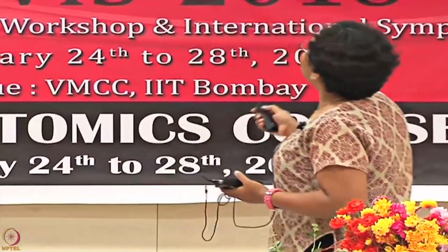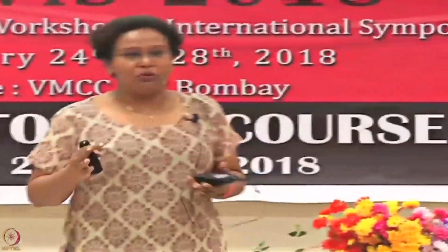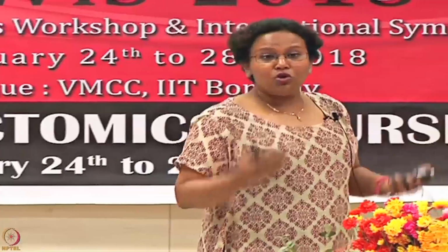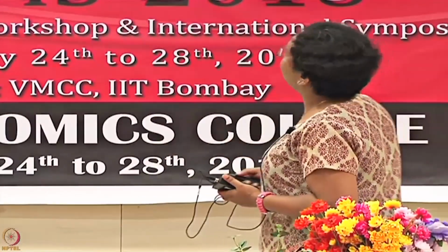If you see here, pH 5.5, which is actually the highest pH here, you attain quite a large amount of RUs. You go to something like, I can't even see, 10,000 RUs, which is an extremely huge amount. You do not need that much protein. If you are reaching around 4,000 or 3,000, it is more than enough to do any of the applications that we are talking about.